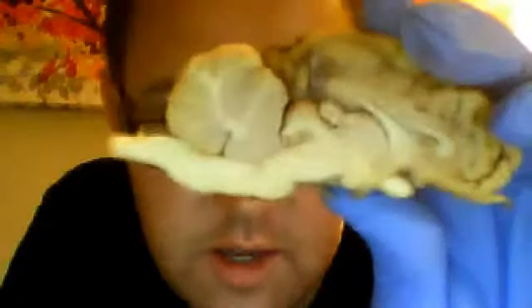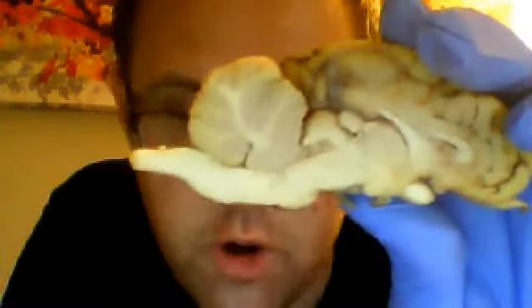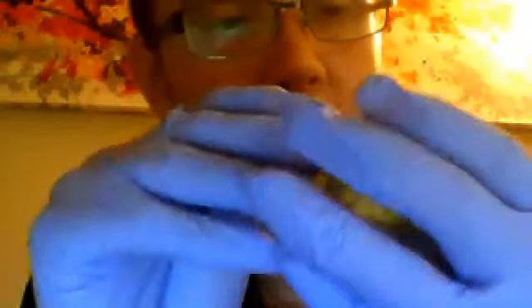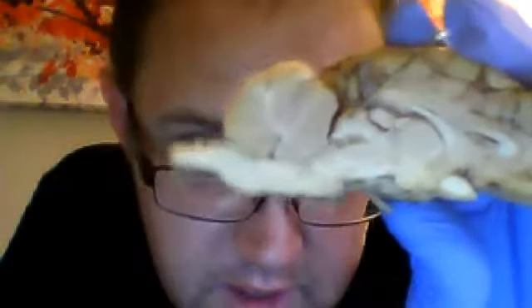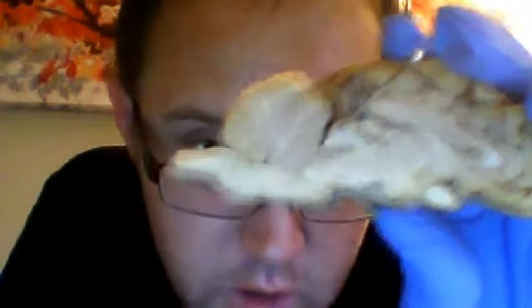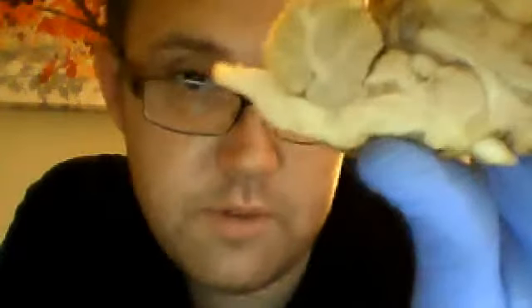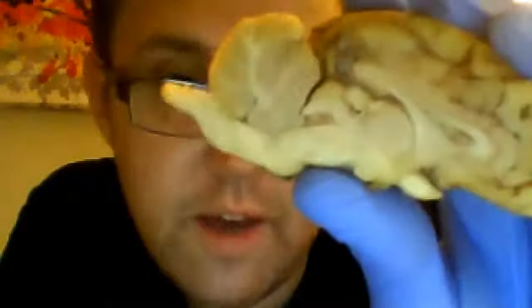If you look at it like this, you can actually visualize what are known as the superior and the inferior colliculi. Now, in order to better point those out, let me get my pen here. So right here, where my pen is, that would be the superior colliculi. Directly beneath it, you have the inferior colliculi.